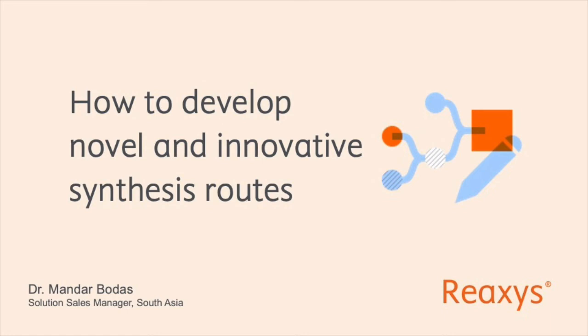Hello, I am Mandar, Solution Sales Manager looking after life science solutions for South Asia. Today I will walk you through how to develop novel and innovative synthesis routes using Reaxys Predictive Retrosynthesis.